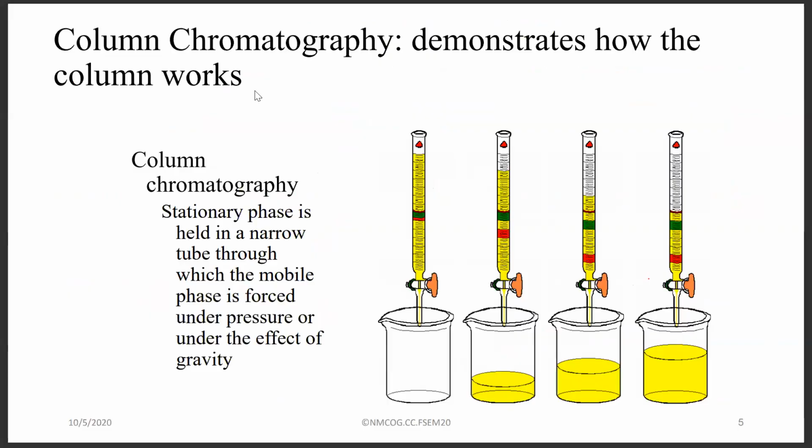Normally, a long time ago, we were mainly using this type of columnar chromatography. Obviously, now we have so many different types which are more modern.